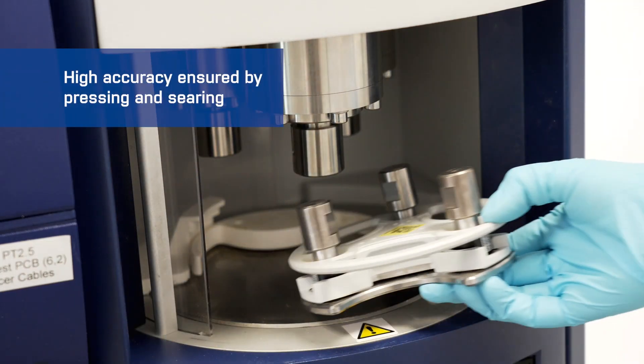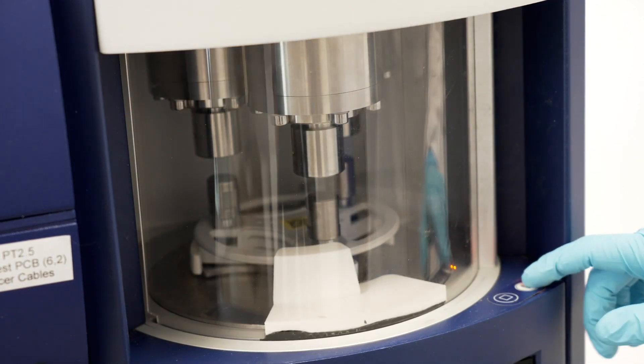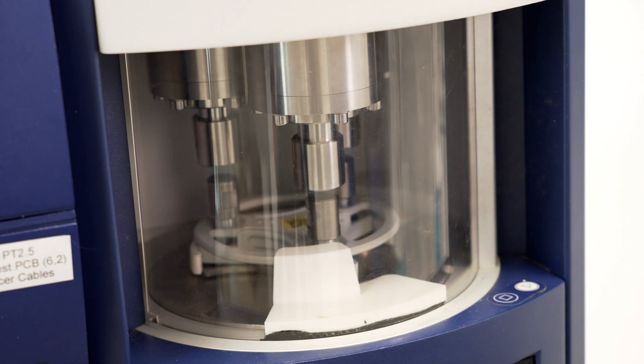The batching tray fits directly into the micropress where the samples are pelletized to ensure a hardened, uniform surface.